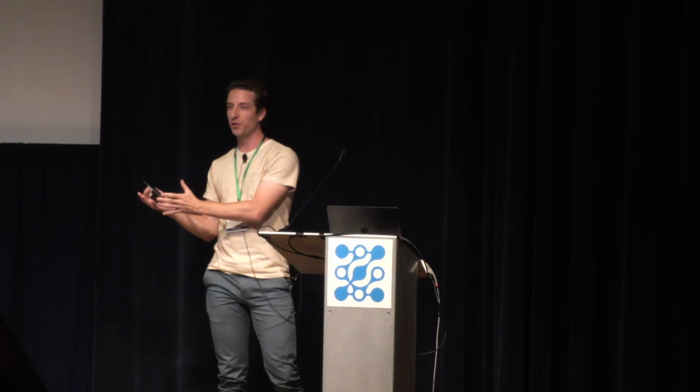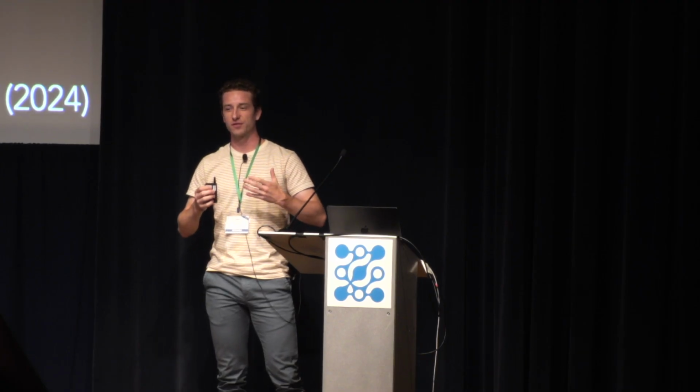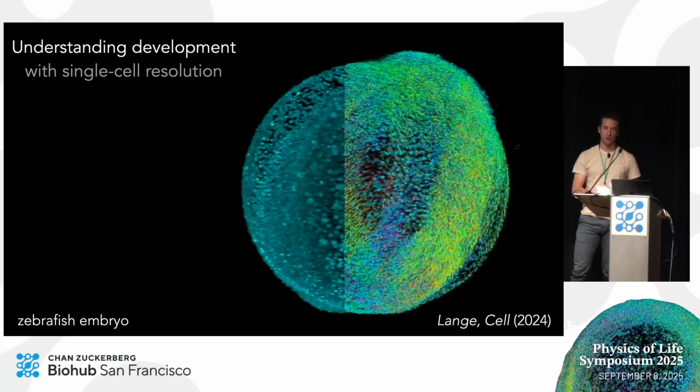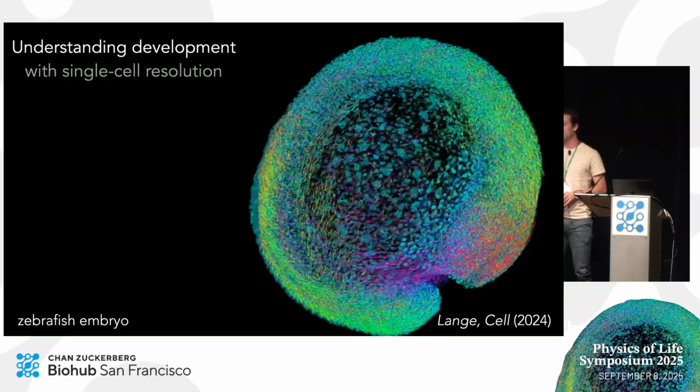And today I will be sharing our recent advances regarding cell tracking, both from the algorithmic point of view and visualization. Because in our group we are trying to understand development, ideally at the single cell level. And in the video here you see a developing zebrafish embryo during its roughly first day of development, imaged in one of our light sheet microscopes.